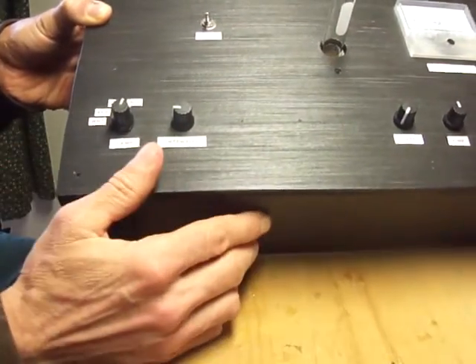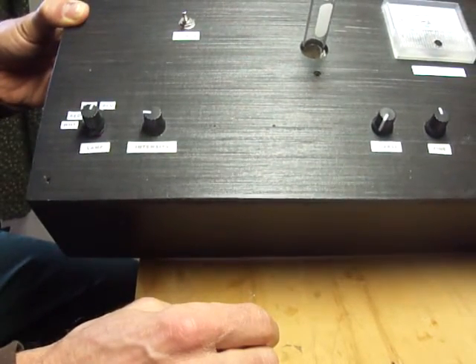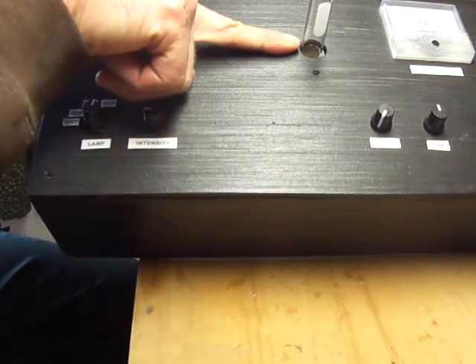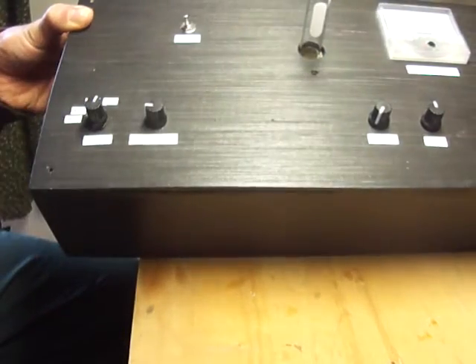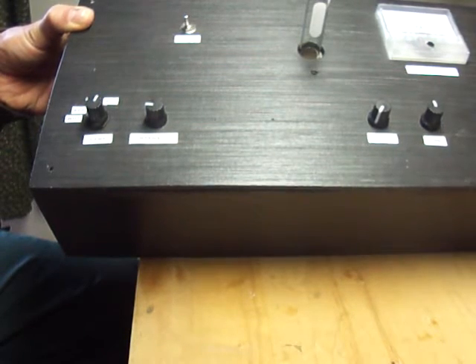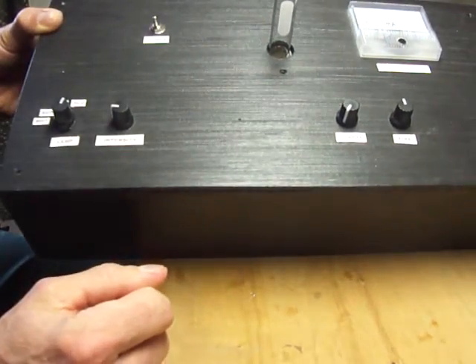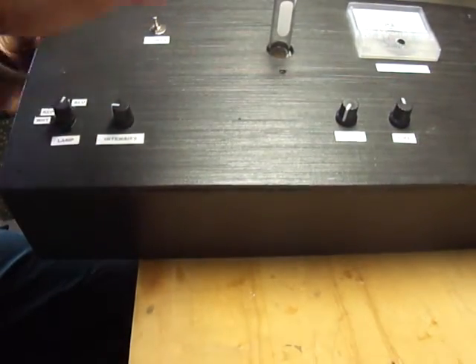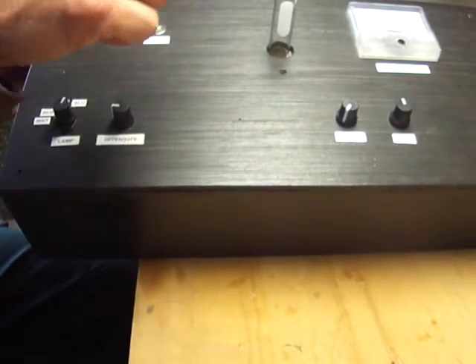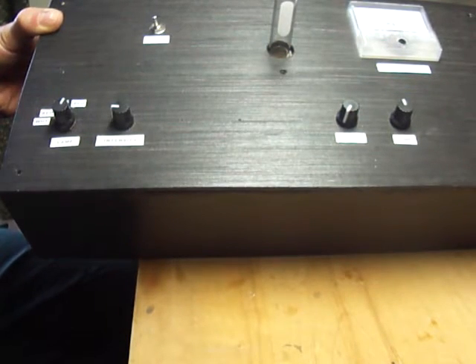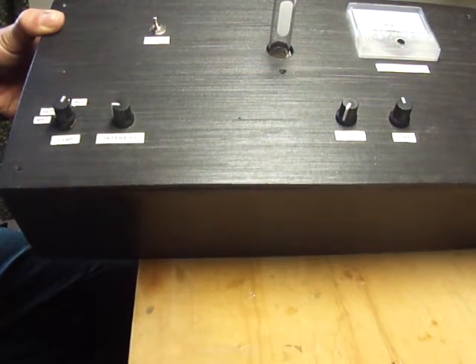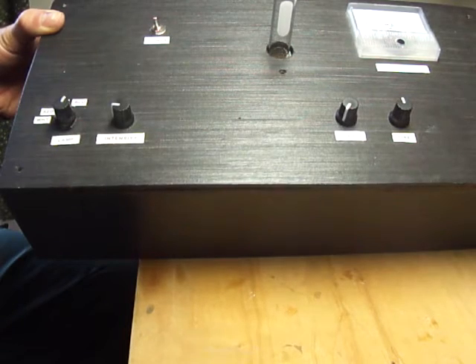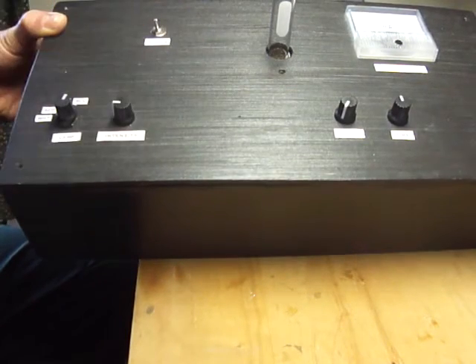The center section is the sample holder where you place your sample. The light source is shining through. In this case I decided to use a clear tube. Most commercial colorimeters use a cuvette, and I left a space right here below it where I could put in a cuvette if I wanted to. A cuvette is a cylinder that has, instead of round like this tube, a long tube that's square in cross section or rectangular. The light hits perpendicular to the surface so there's no refraction and comes straight out the back side. But I think for what I want to do this is going to be plenty fine.